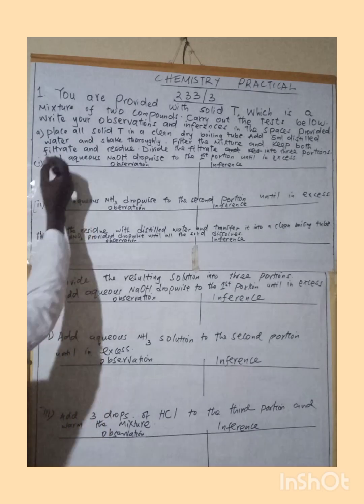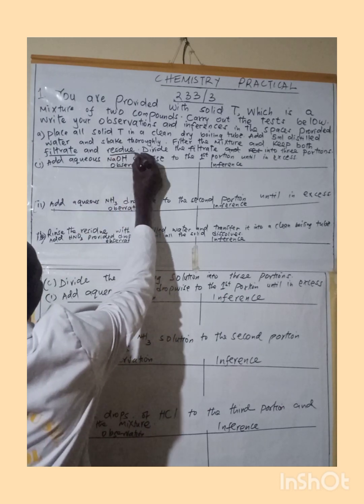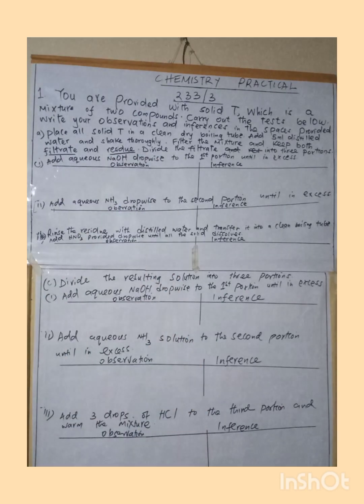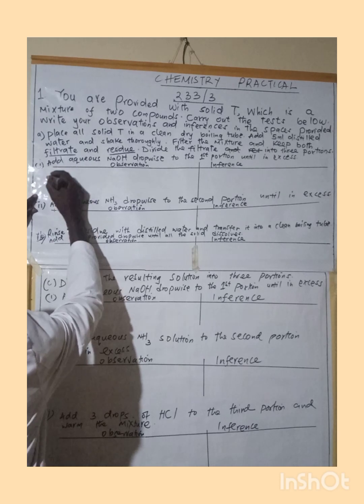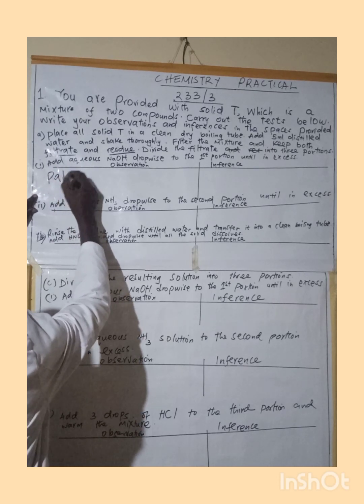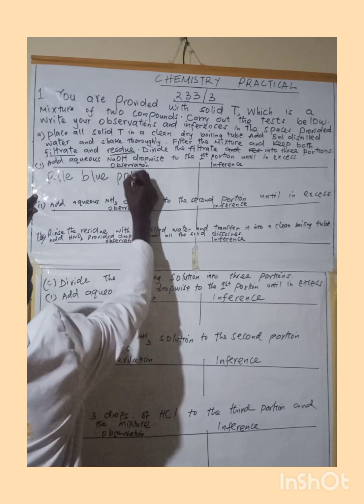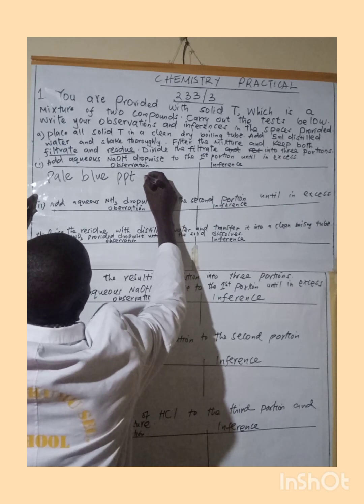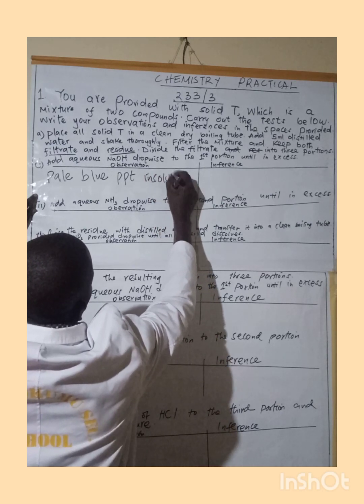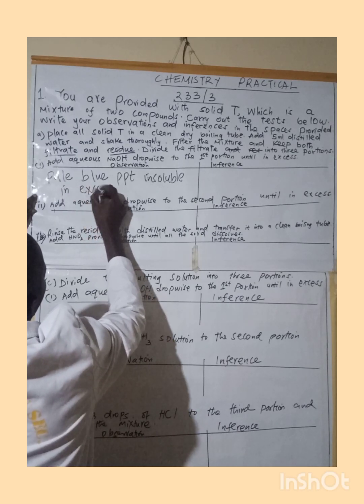So our concentration should be on the residue and the filtrate. So the observation which was made in this experiment is that a pale blue precipitate, insoluble in excess.